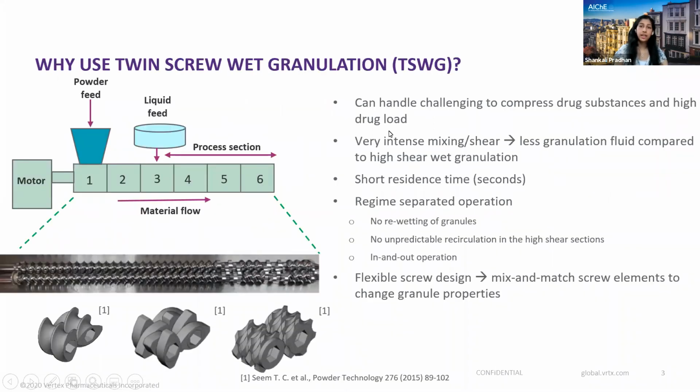Wet granulation in general can handle challenging to compress drug substances as well as high drug load formulations. But twin screw is unique in the sense that it offers intense mixing or shear, so it uses less granulation fluid compared to some other methods of wet granulation.